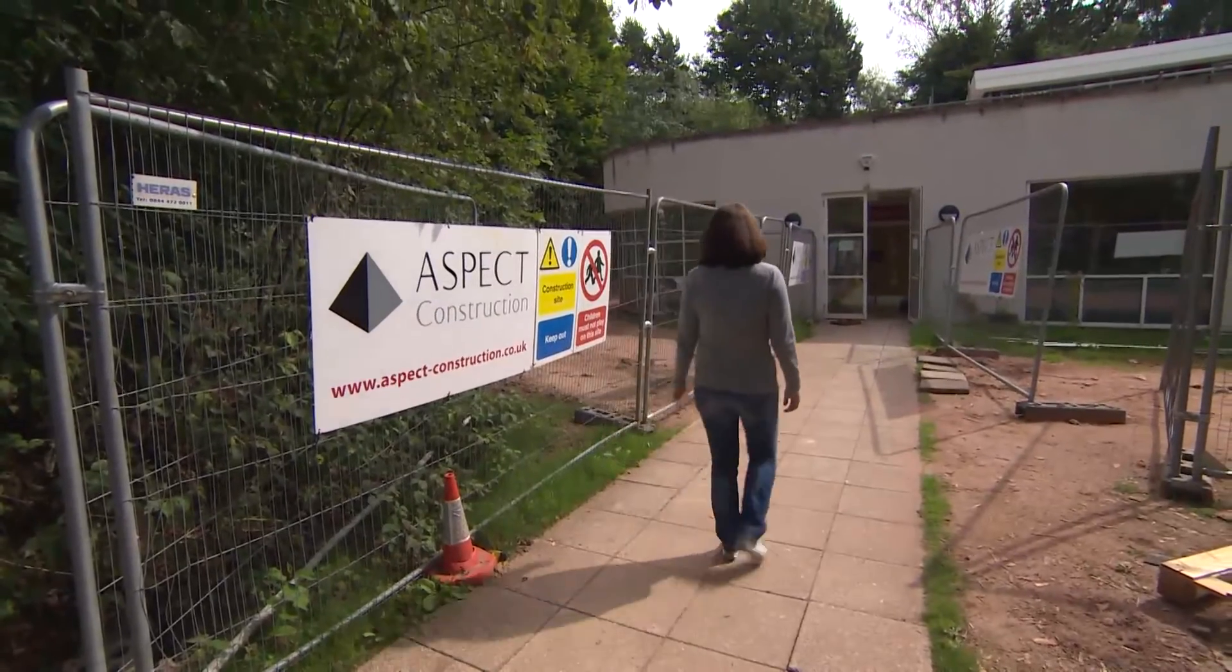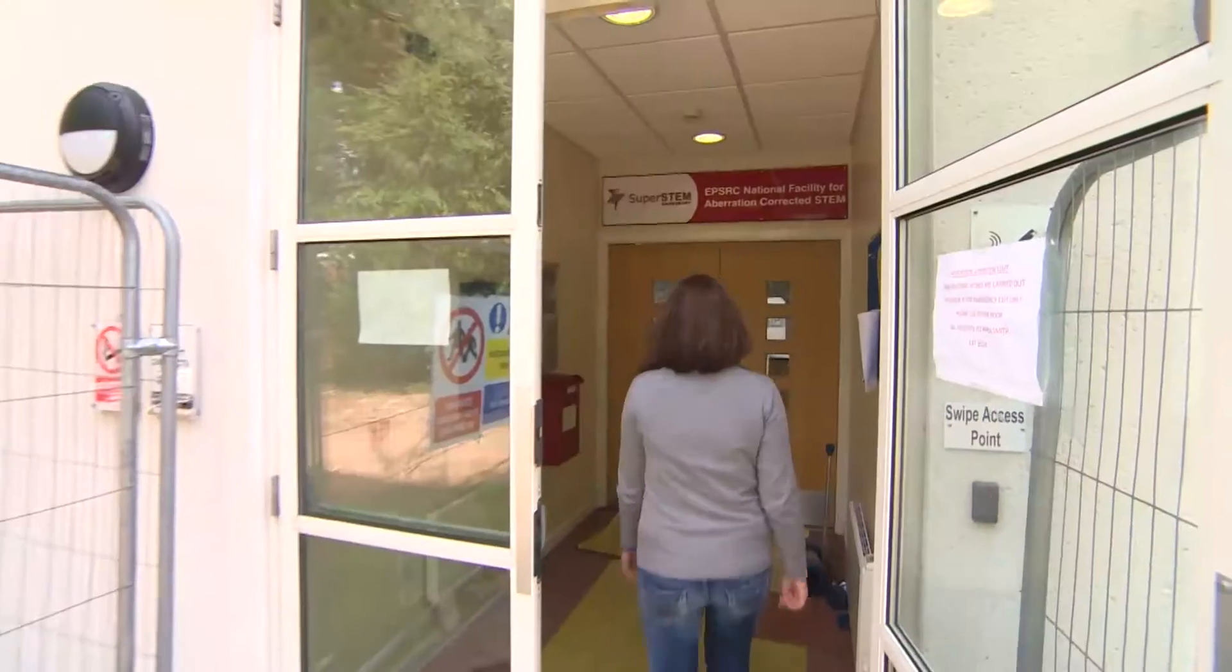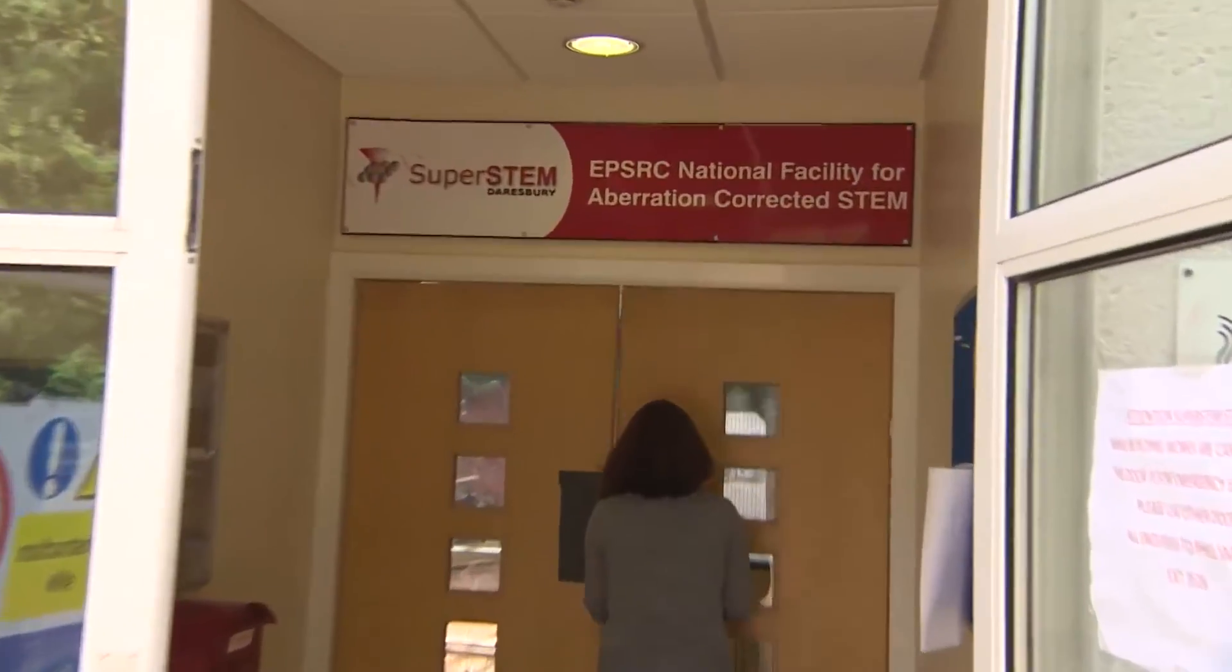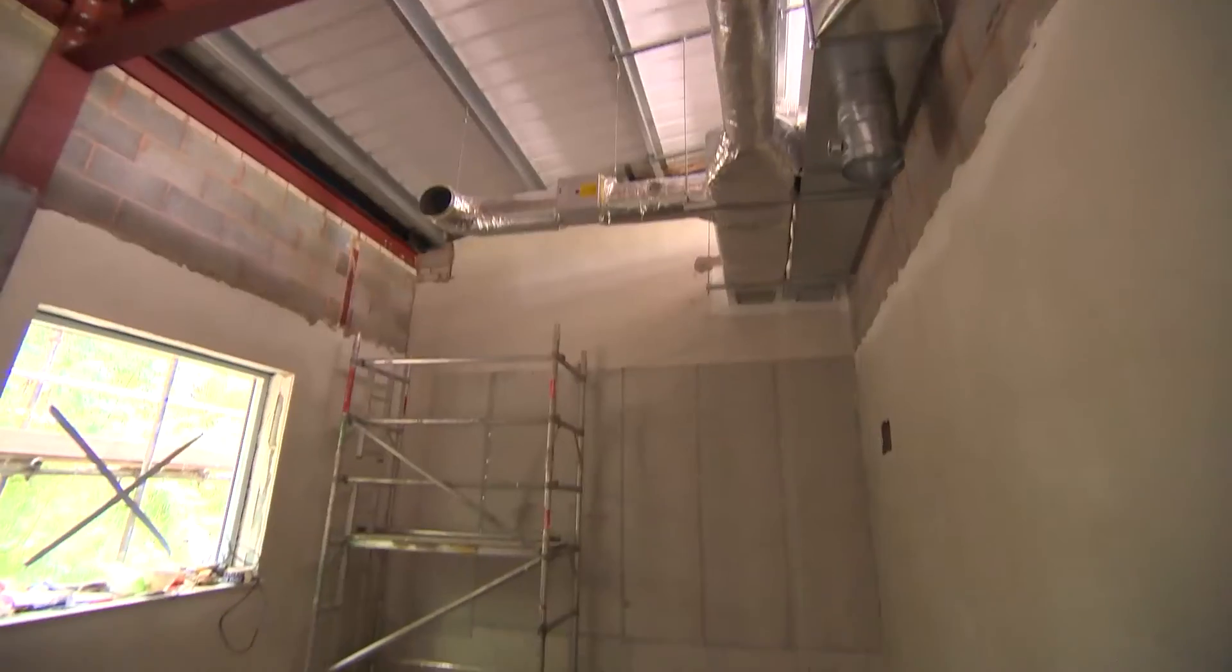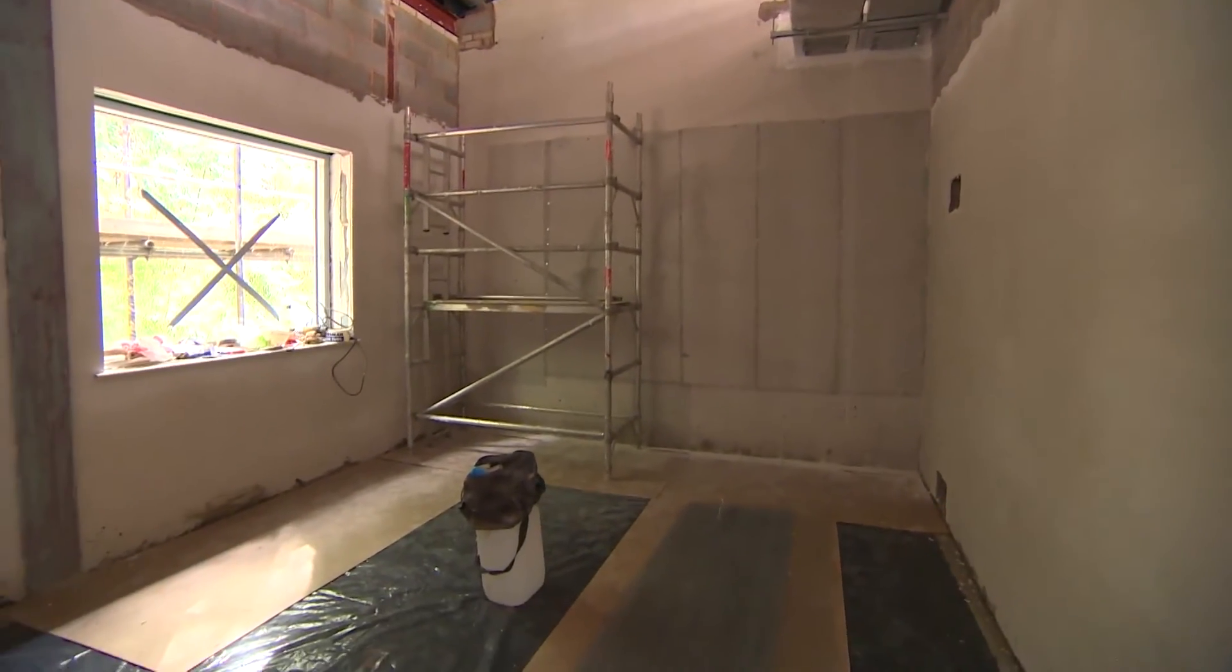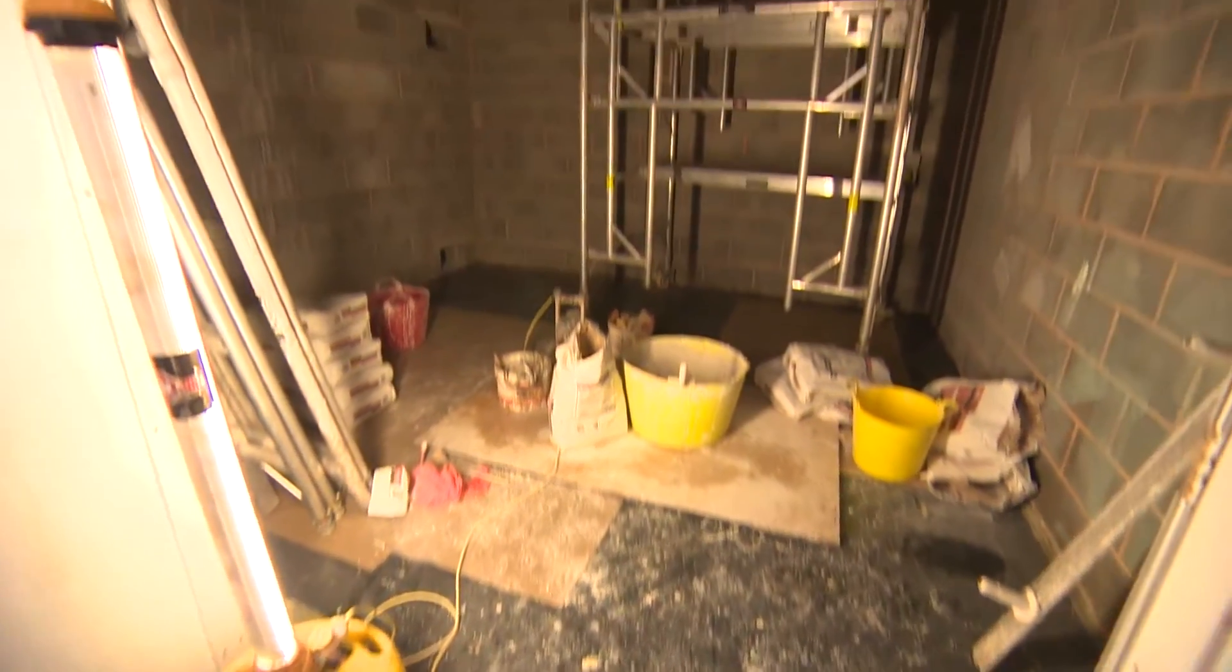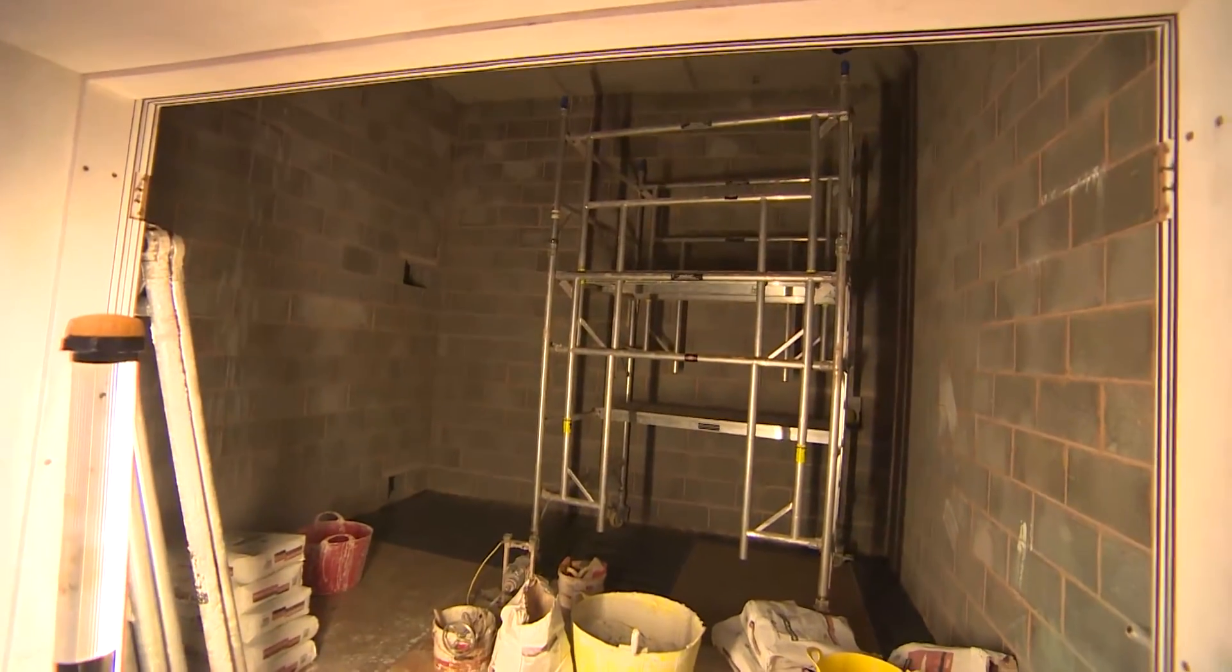These are very exciting times for SuperSTEM. We're expecting in a few months the installation of the third instrument called SuperSTEM 3. The energy resolution of the microscope will be improved by about two orders of magnitude, which will allow us to do experiments at the deep valence level. It's going to be one of the best microscopes in the world in terms of energy resolution and the only one installed in Europe of this kind.